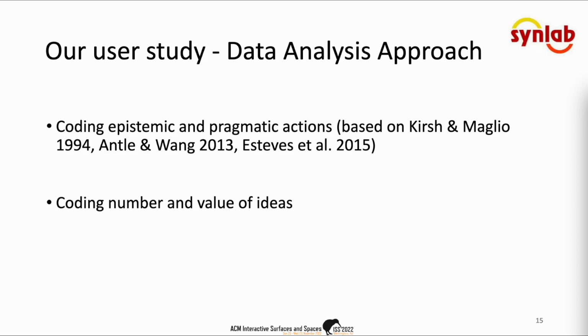Epistemic actions help users reduce cognitive load through alterations in their world that lead to a decrease in task complexity, and play an important role in problem solving tasks. In contrast, pragmatic actions are definitive and directly bring the user closer to their goal.